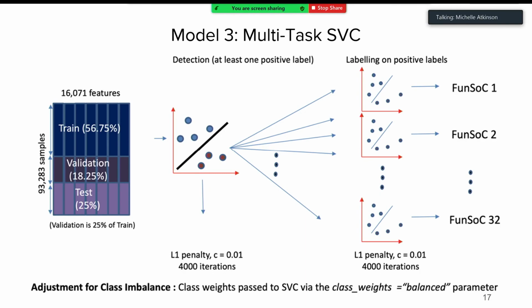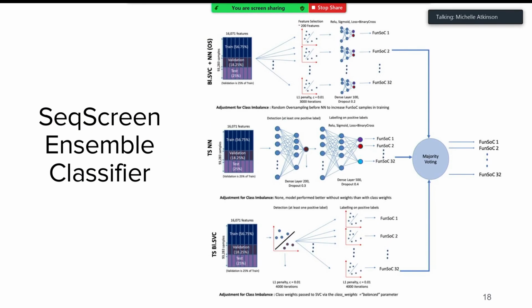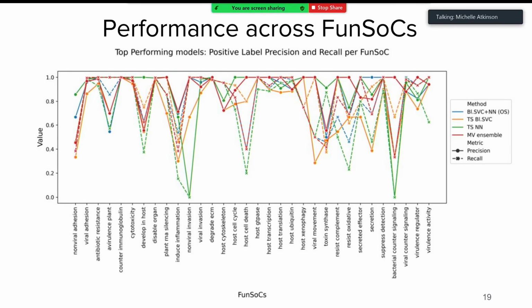Again, this had never been done before, and it was very expensive to generate this essentially hand-curated training data set. So we then combined all three of these into an ensemble classifier and compared that to each individual classifier on this known training data set. And using that information, we evaluated on a test data set.